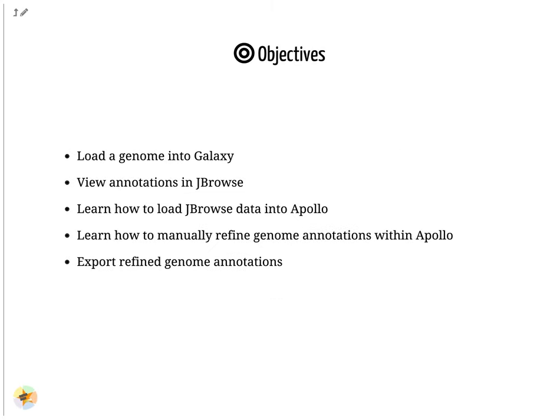In this tutorial, you will learn how to load a genome into Galaxy, view annotations in JBrowse, load JBrowse data into Apollo, manually refine genome annotations within Apollo, and export refined genome annotations.